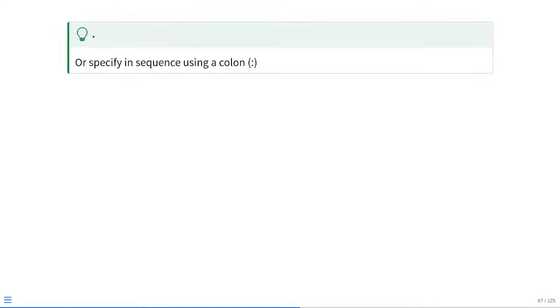If we wanted to return multiple of these, we'd use a colon. This is what it would look like. What we're telling R is, for this floors object, grab everything from the third all the way to the fourth object and return those values to me, in which case it's returning PE and APC.